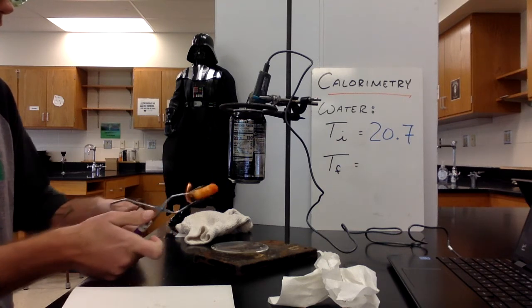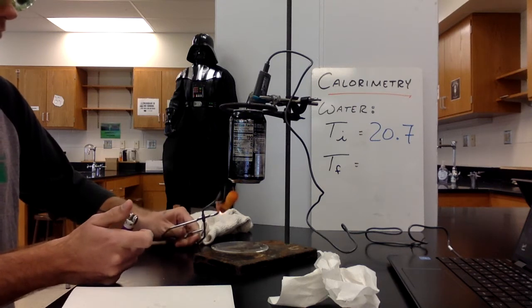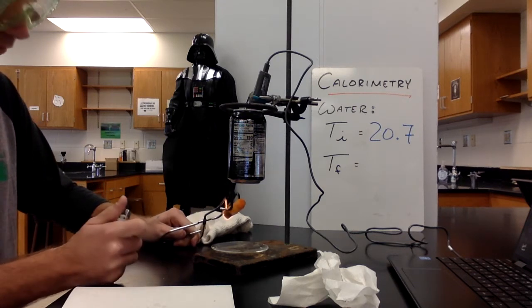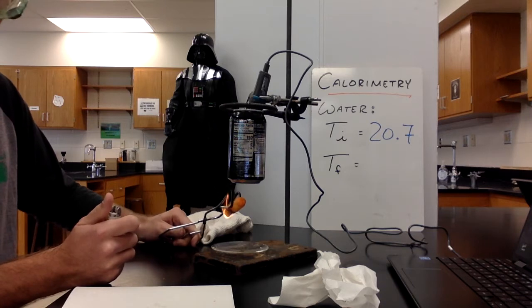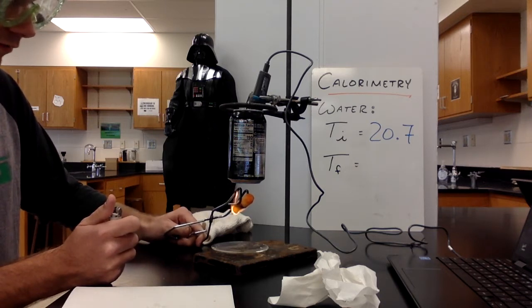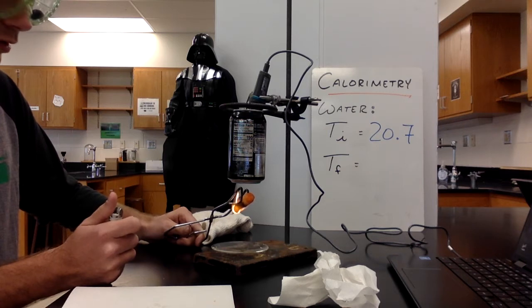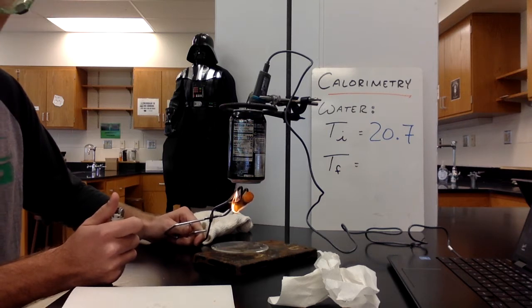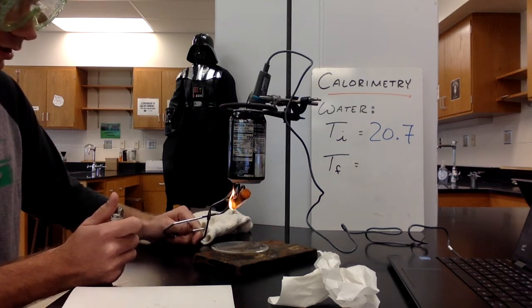Get her flaming. Flaming hot Cheeto or cheese doodle. We'll let that heat exchange from food to the can containing our water.